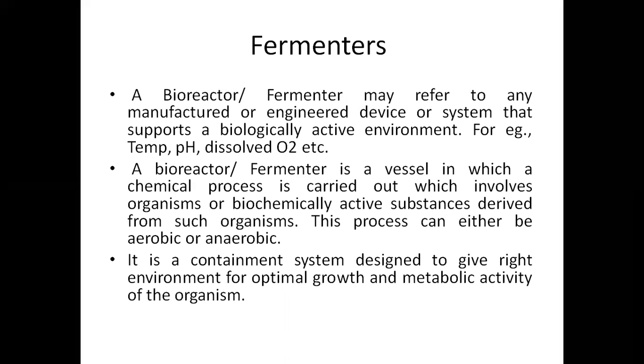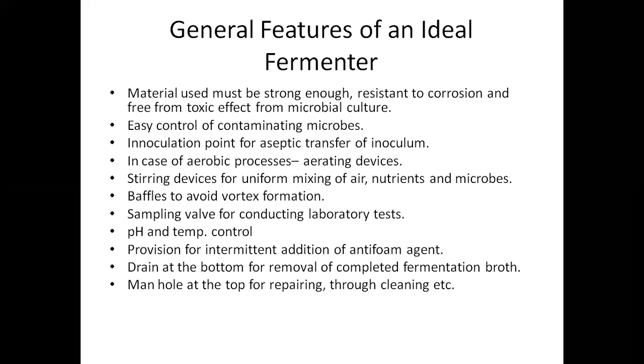In this engineered device or system, the environment is controlled in a very precise manner so that the manufacturing of the product can be controlled. So it can also be regarded as a containment system which provides the right environment for the optimal growth and metabolic activity of the organism.